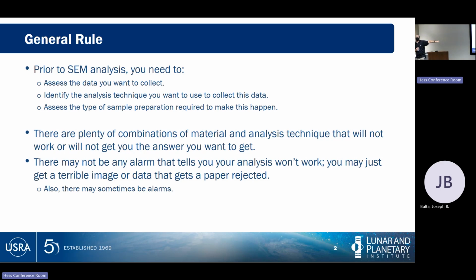And if you don't do this assessment, the downsides can be a damaged SEM, which is a $100,000 instrument at the minimum, or a paper that's rejected that you spent a lot of time on. And I've had to reject things before where people tried to put SEM analyses into something that they couldn't do, and it wasn't capable of doing what they wanted it to do.